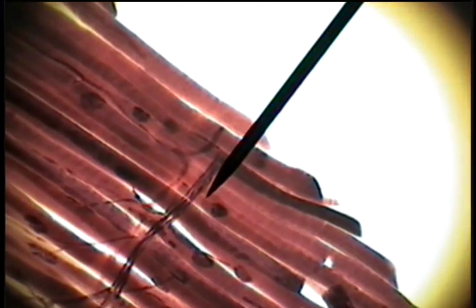What we see coming in across here is a motor nerve. As the motor nerve approaches the skeletal muscle, it will branch out and produce these motor nerve endings or myoneural junction, motor end plate or myoneural junction.